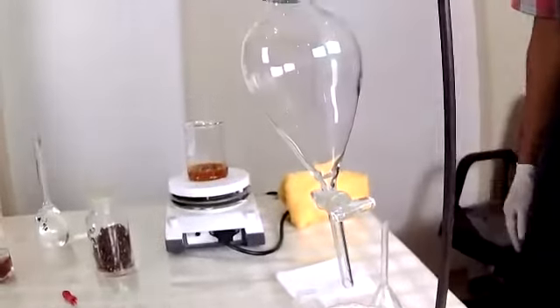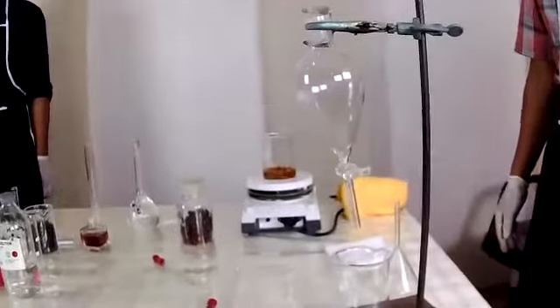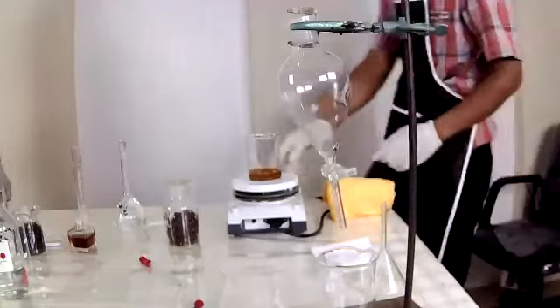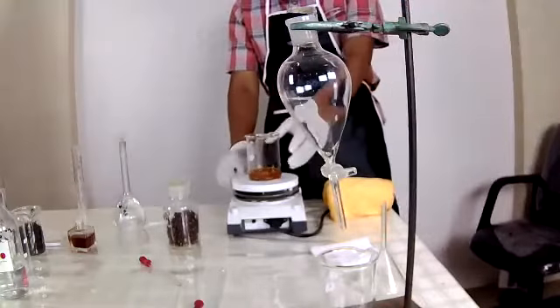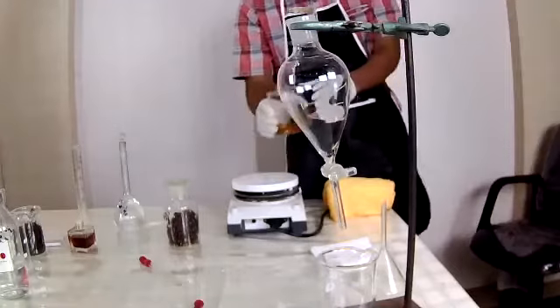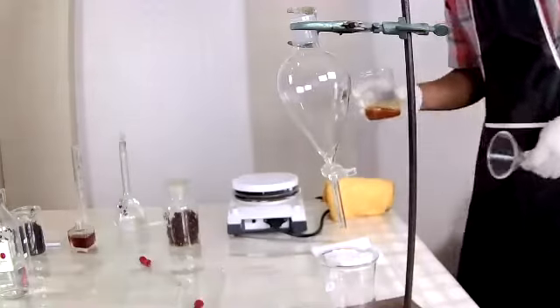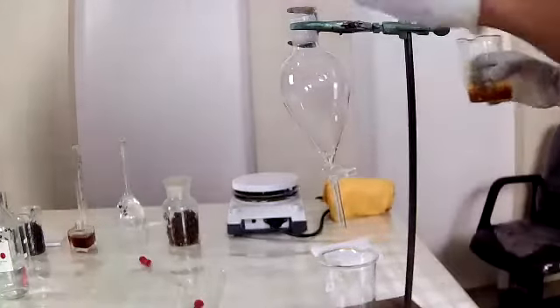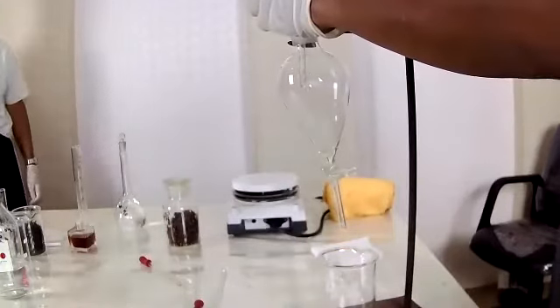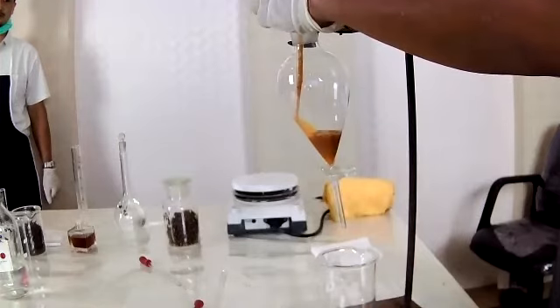And you can see our equipment here for the extraction. This is actually not the matching support here, but I think it's also okay. It's fine. We make use of what we have available. Now we pour it into the funnel.